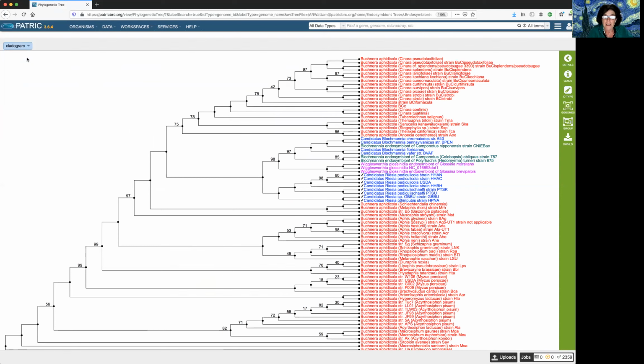But if you wanted to publish this tree, which you wouldn't want to, because it's only 5 genes, and I'll show you how we can make this tree a lot better. So it is publication quality and also with better support and also looking much more awesome, not due to our program, but due to the number of genes that you choose and things like that. You couldn't do it with these colors, so you would have to take it elsewhere, as I said before.